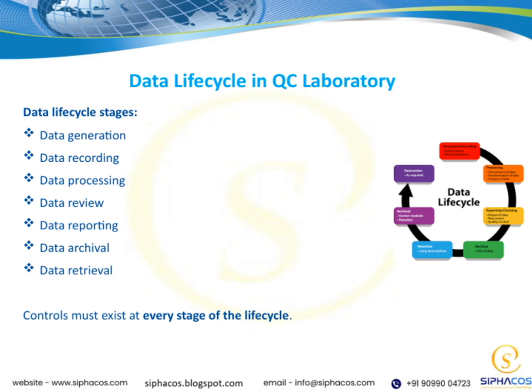Once reviewed, the data is compiled into reports in the data reporting stage, which are then used for decision-making and regulatory submissions. Following reporting, data archival ensures that all records are stored securely for long-term access and compliance purposes. Finally, data retrieval allows us to access and review data when needed, whether for audits, investigations, or ongoing analysis.